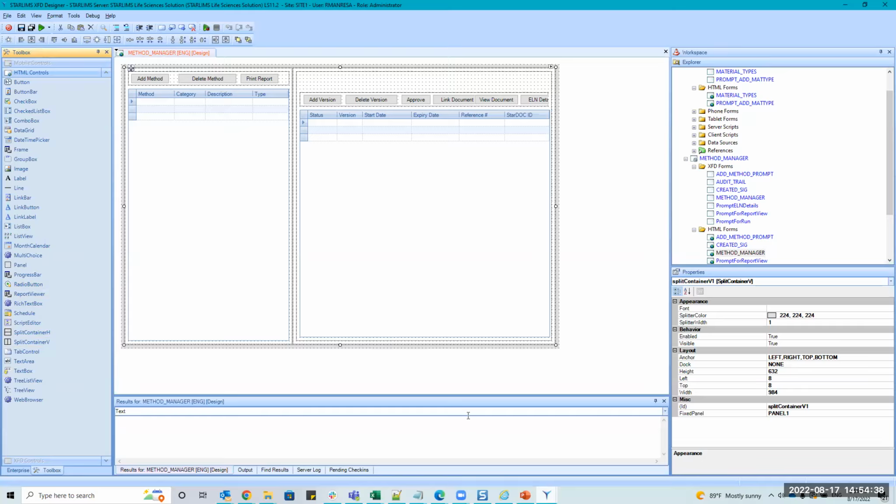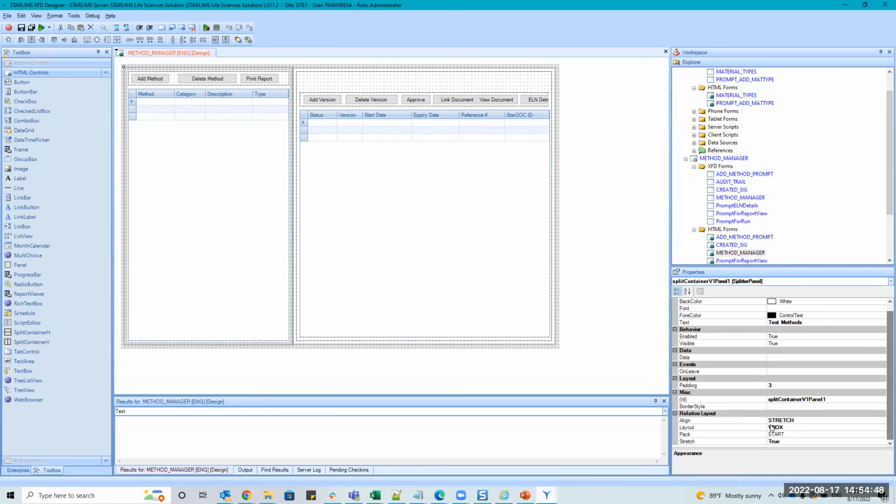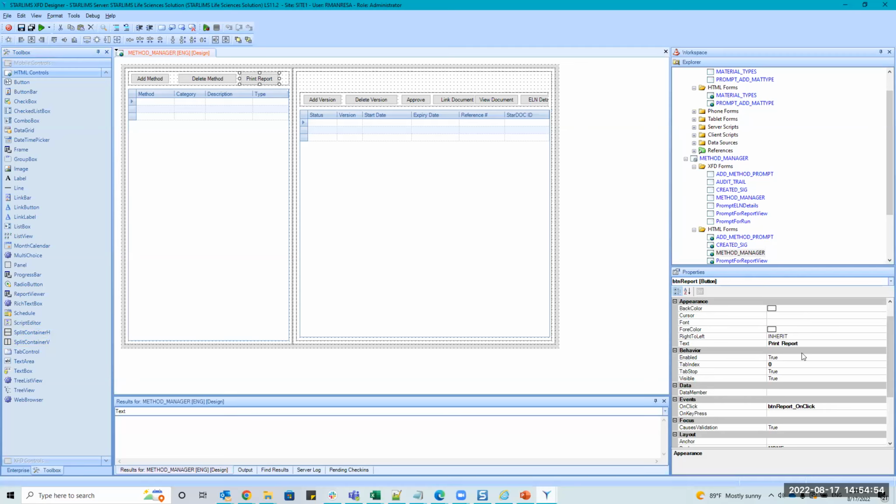They've introduced additional panels and controls here with splitters, and then relative layouts. That's the big thing. So relative layouts on the panels themselves, and no longer doing the anchoring for the most part. You'll still see the anchoring, but you shouldn't be doing anchoring. You should be doing relative layouts. Anchoring was a thing of XFD, and it doesn't work as expected in this new version.